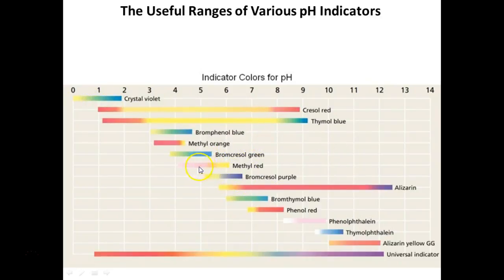Methyl red right there, as you can see, it's really in the acidic range of pH ranges. Here's phenol red. So notice it turns yellow at not quite an acidic pH. I mean, just barely acidic. So all those yellow tubes I handed out to you guys, those could have just barely passed over the acid threshold.